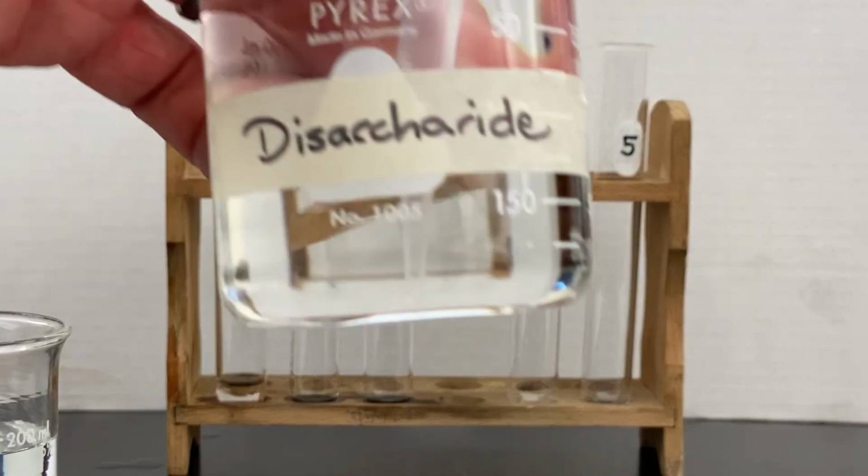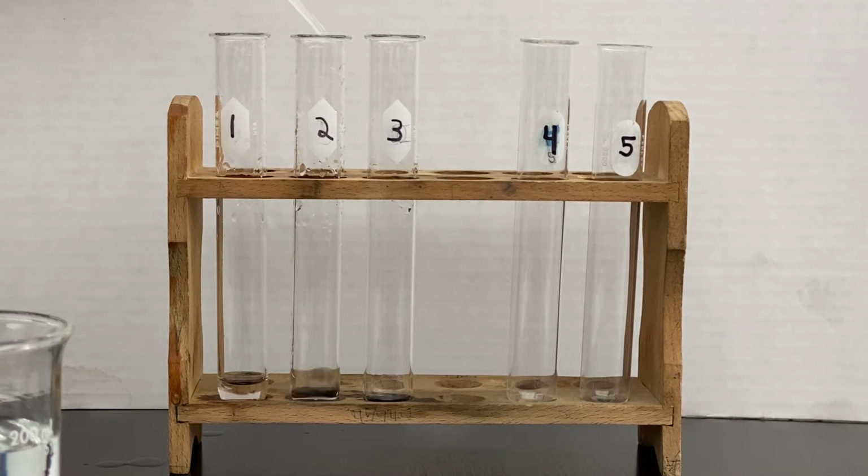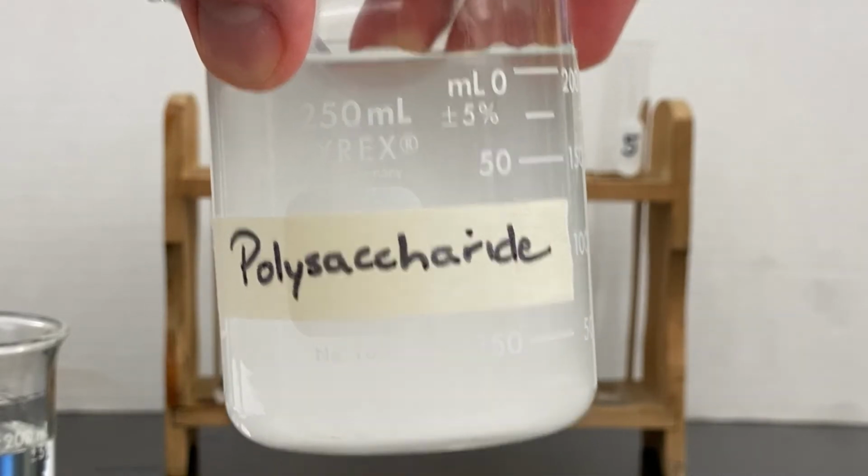Here is my disaccharide solution. We're going to do 30 drops of it. And then once again, there's my polysaccharide solution. We'll add 30 drops to test tube number 3.